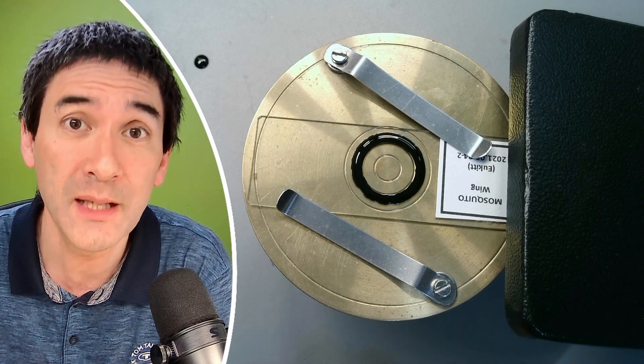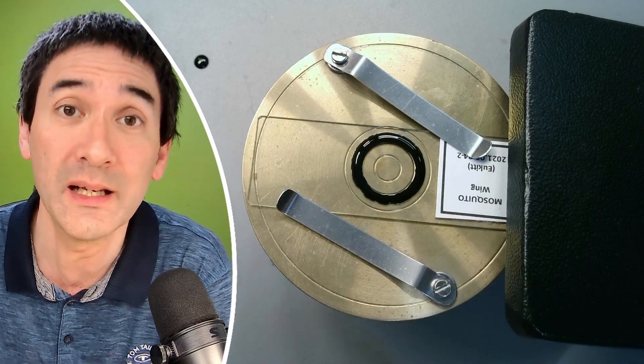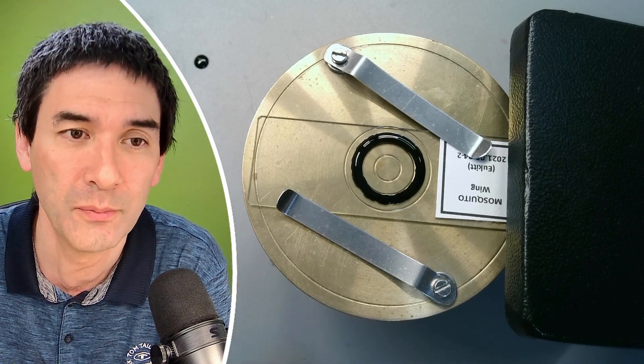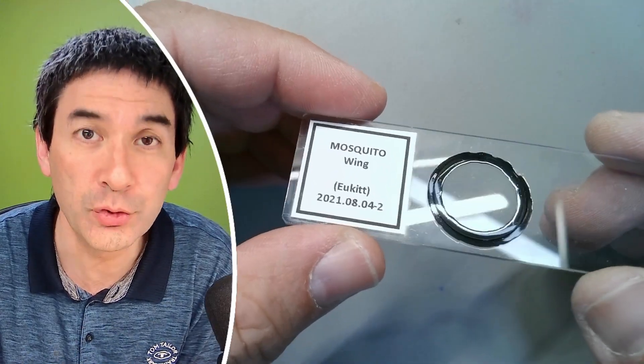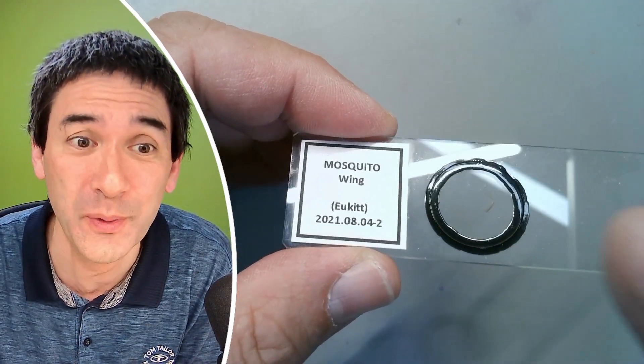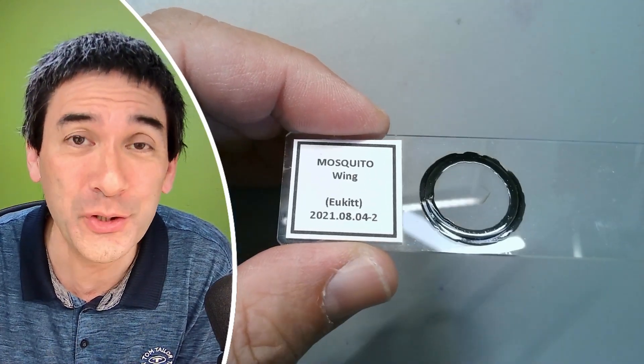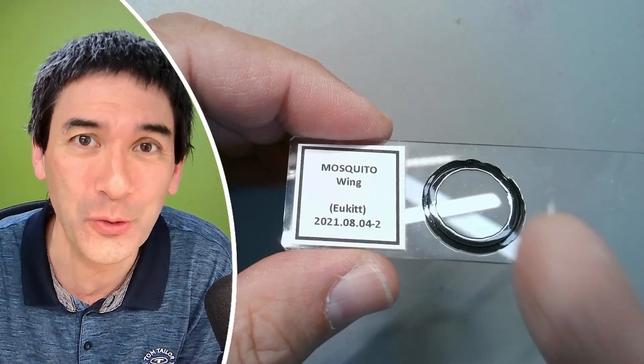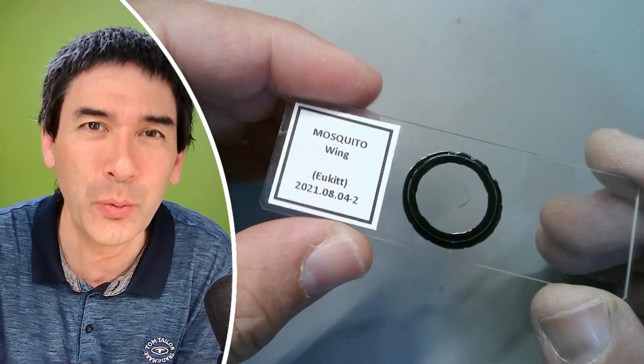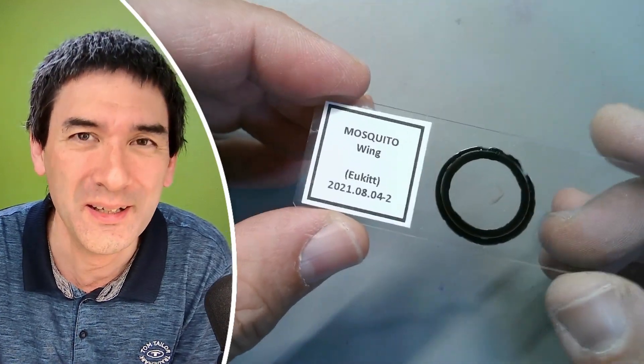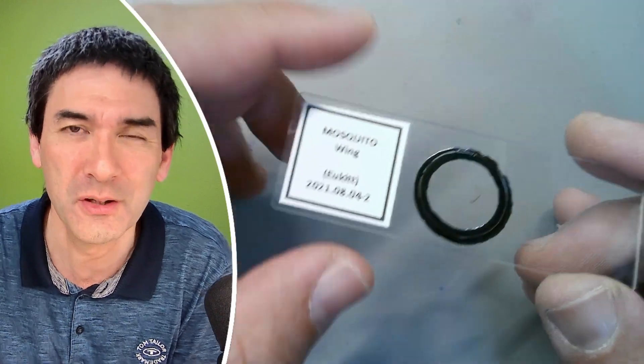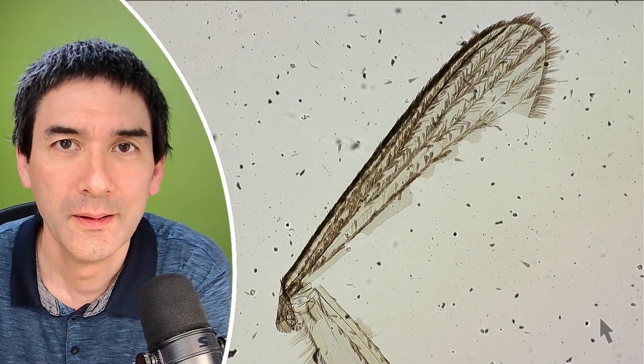So the nail polish is now dry, so I can put it under the microscope. Always be careful. Never put slides with liquid nail polish under the microscope. Otherwise, there's the danger of getting some of the nail polish on your microscope objective. Let's have a quick look if the mosquito wing, of course, still looks nice even after four years. I don't see a reason why not.